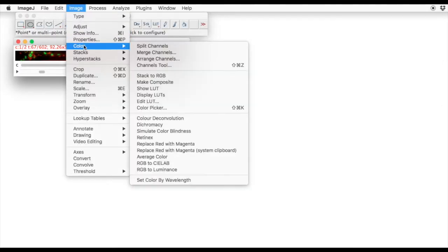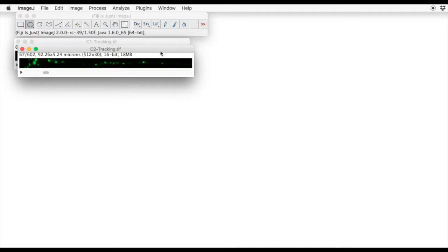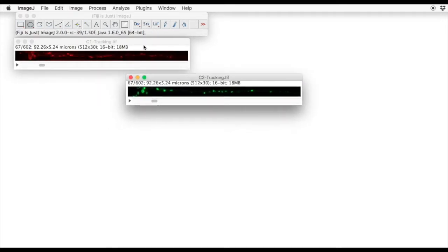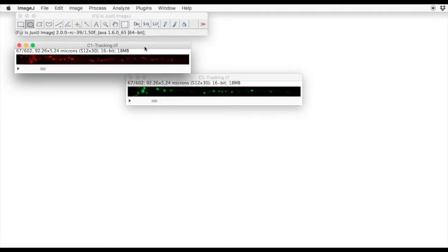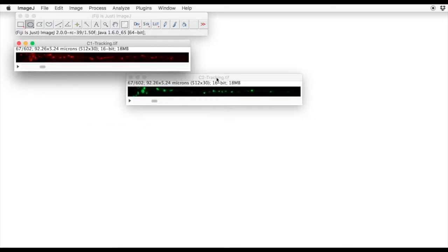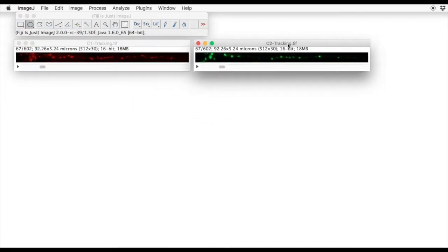First, we're going to separate out the channels, split channels, and we're going to perform a kymogram on one channel at a time.